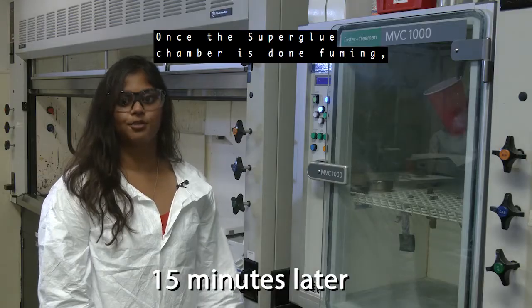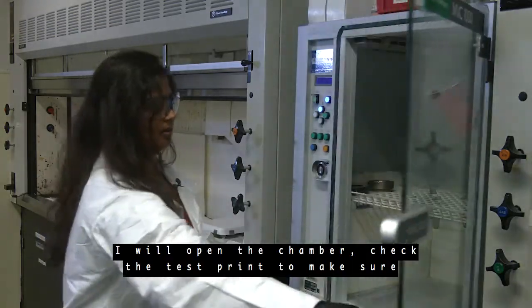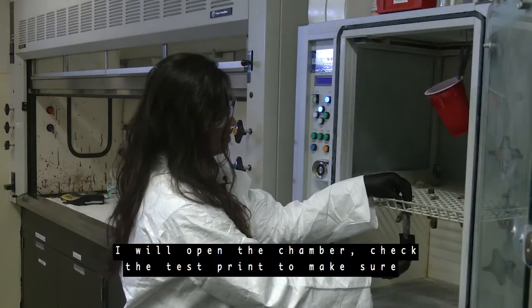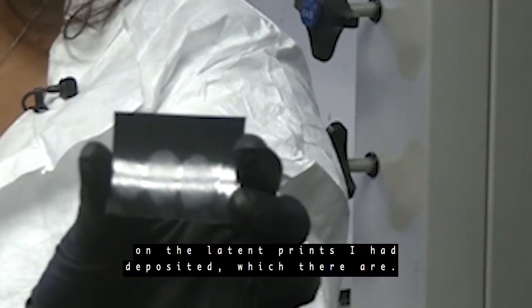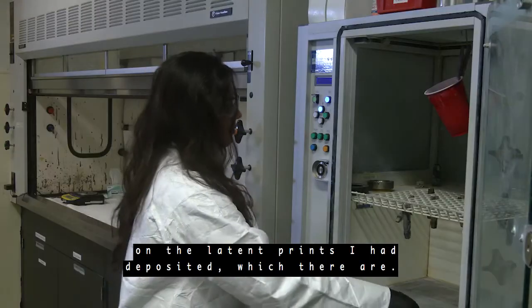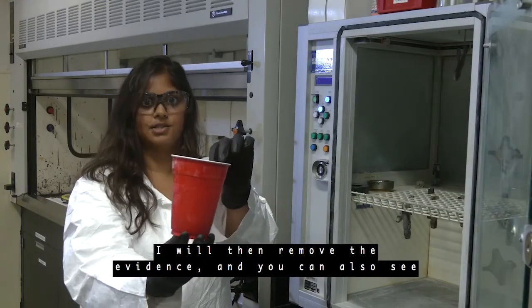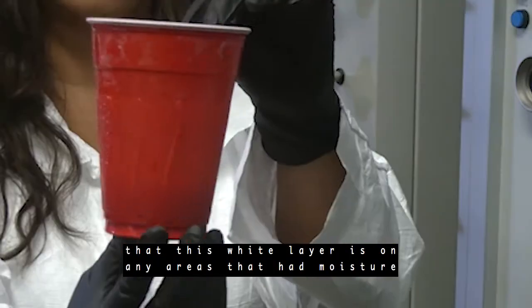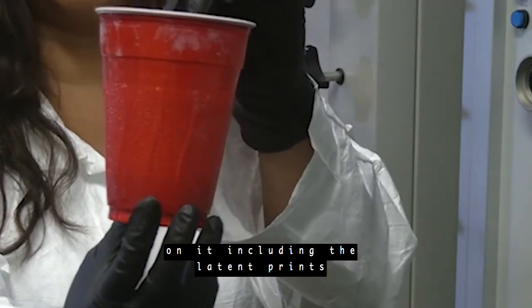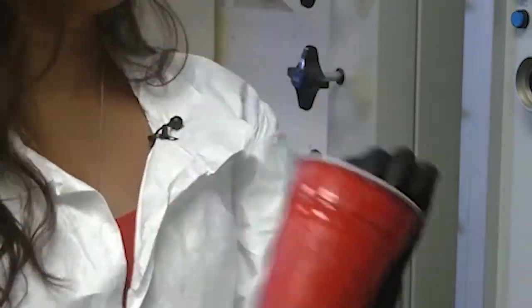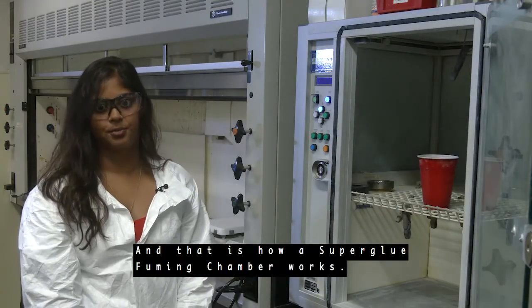Once the superglue chamber is done fuming, I will open the chamber, check the test print to make sure that there is a white layer on the latent prints I had deposited, which there are. I will then remove the evidence and you can also see that this white layer is on any areas that had moisture on it, including the latent prints that are along the top edge of the cup. And that is how a superglue fuming chamber works.